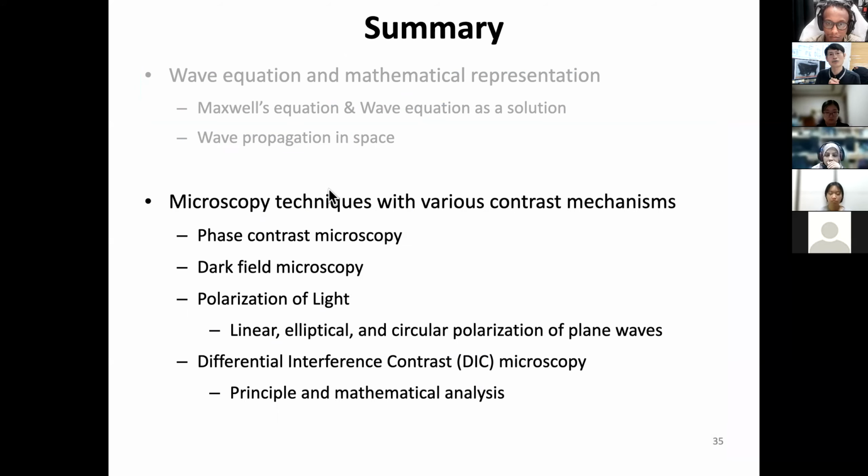Today, we discussed contrast mechanisms in imaging. Imaging is about contrast, whatever property, physical, chemical, or even something very weird where we didn't even have the sample, for example radionuclides, something which gives a contrast. That's how we can make an image recognizable, quantifiable, and analyzable.